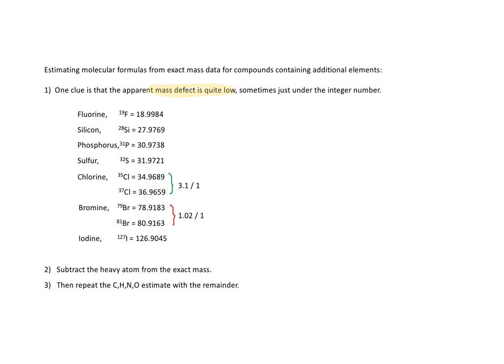In addition, the mass spectrum will often reveal chlorine or bromine atoms by a distinct doubling of peaks separated by 2 atomic mass units, with chlorine approximately a 3-to-1 ratio, and with bromine approximately a 1-to-1 ratio. Let's try these methods with a couple of representative data sets.